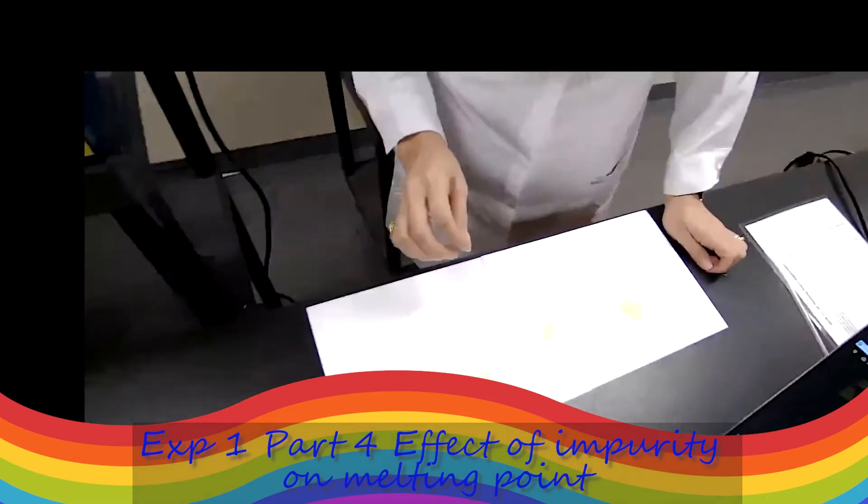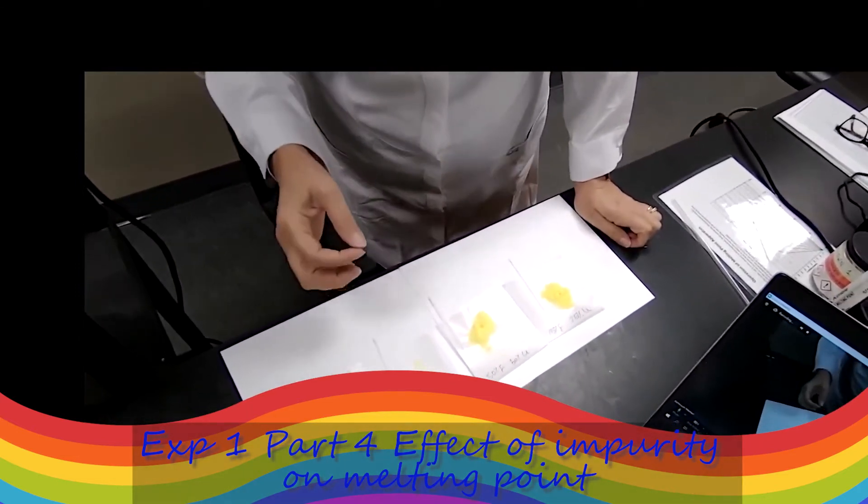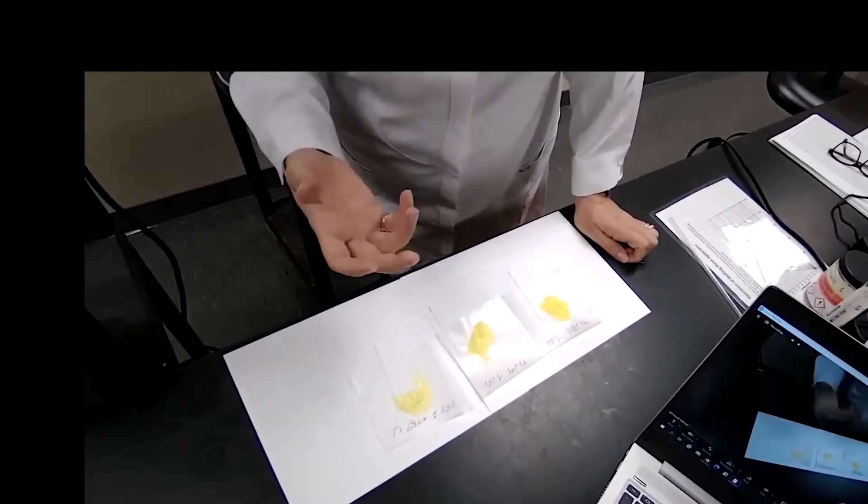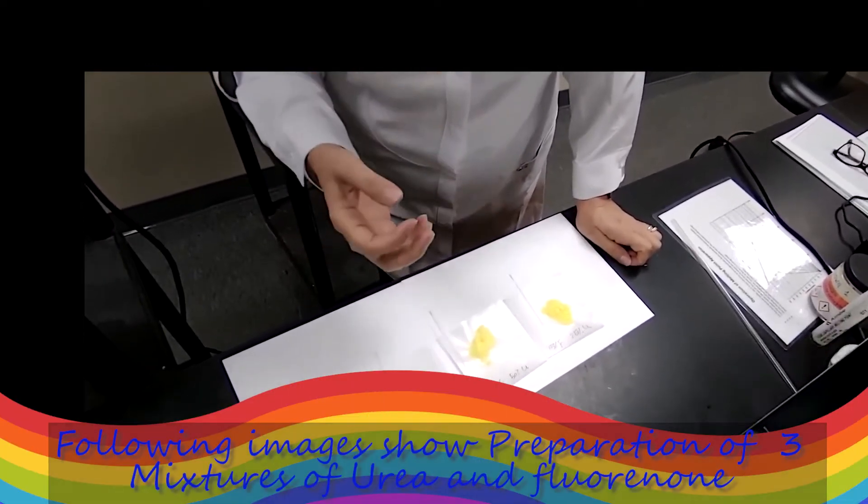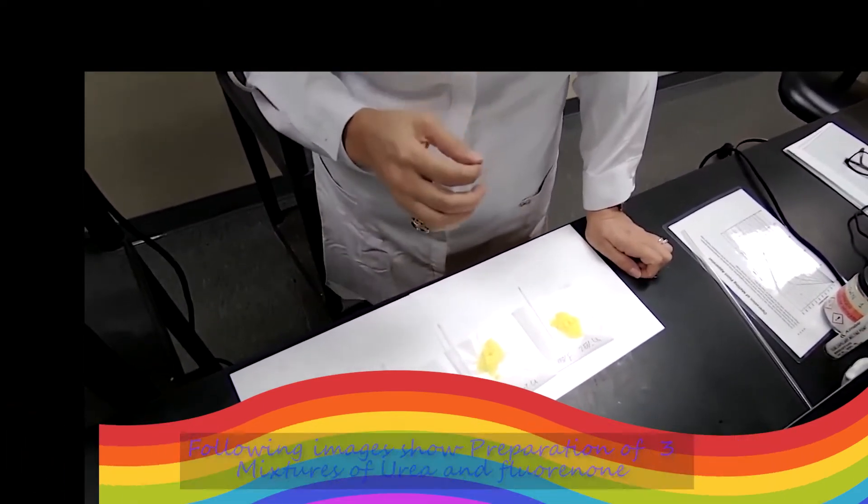The last part of the experiment is to study the effect of impurity or percent of impurity on melting point. The higher the percentage, the change in melting point or melting point depression is going to be more significant.